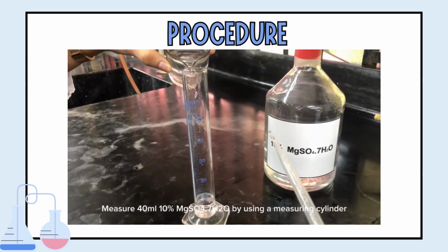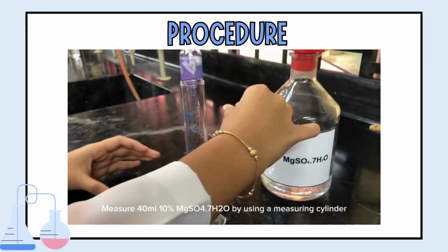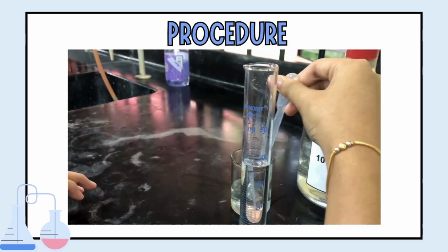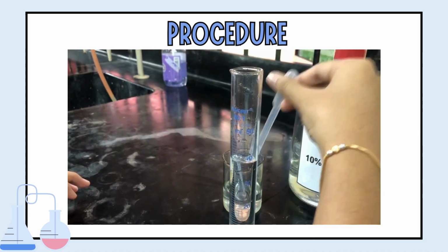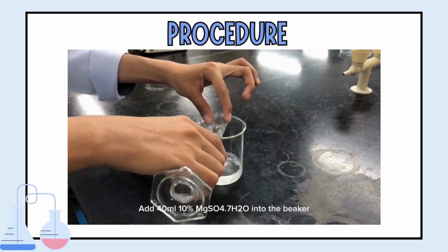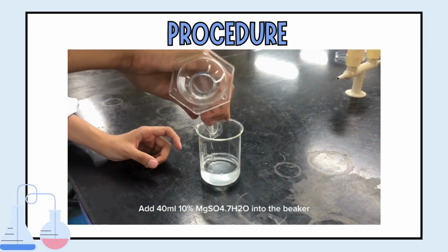Measure 40 ml of 10% magnesium sulfate hydrate using a measuring cylinder. Add 40 ml of 10% magnesium sulfate hydrate into the beaker.